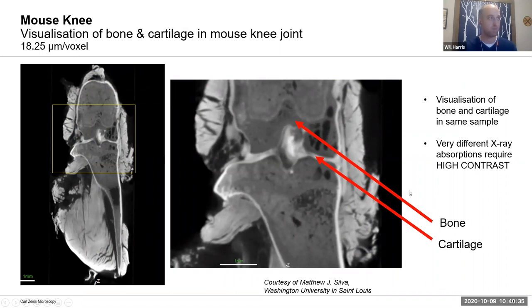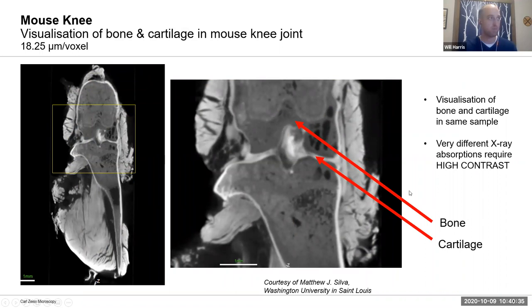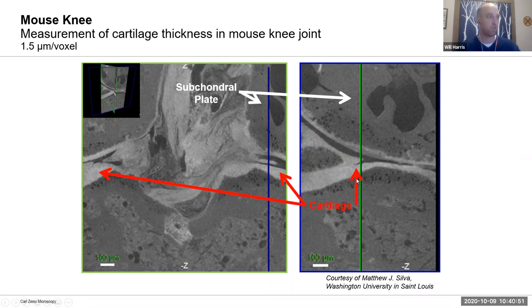It's not only mineralized tissue but cartilage and soft tissue as well. This is a quick example looking at a mouse knee joint where we can differentiate bone and cartilage layers based on contrast, and if you zoom in you see that in even better detail — pretty strong density differences between these different phases.